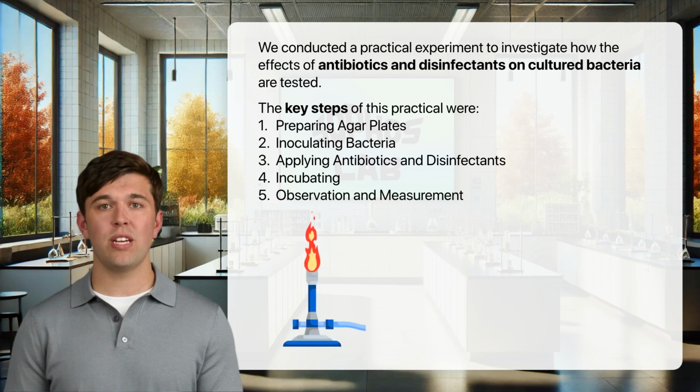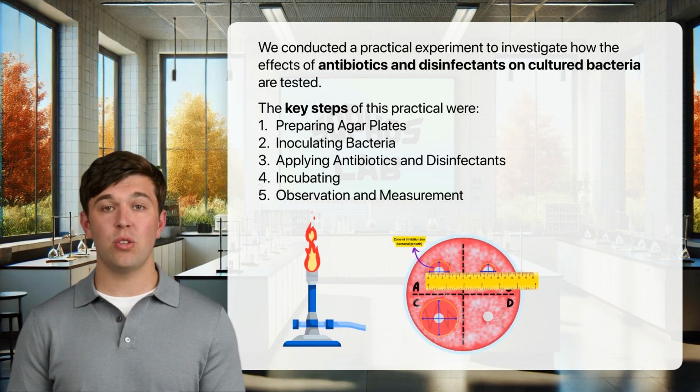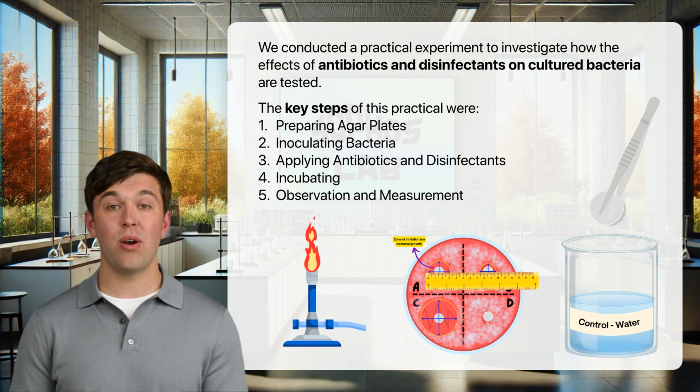One of the key takeaways of this practical is the importance of using sterile techniques to avoid contamination and obtain accurate results. More information on this is in our lesson on aseptic techniques. We also learnt the importance of precise measurements to record zones of inhibition, as well as understanding the use of controls to validate experimental findings. This practical not only reinforced our knowledge of how antibiotics and disinfectants function, but also highlighted the critical techniques involved in microbiological experimentation.